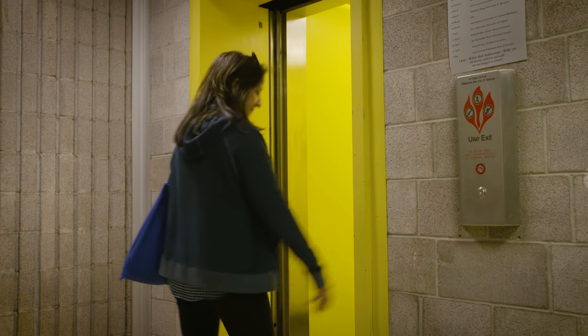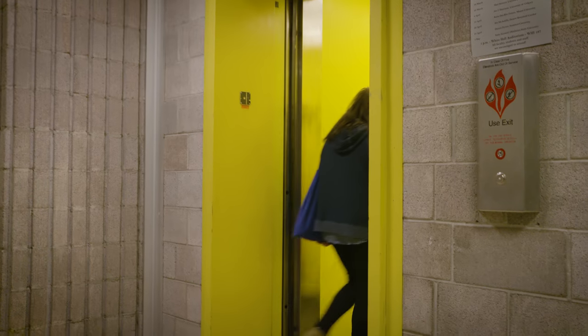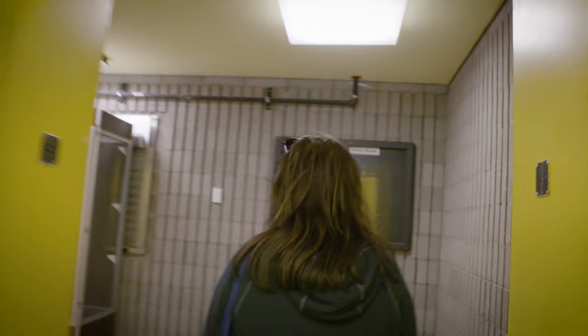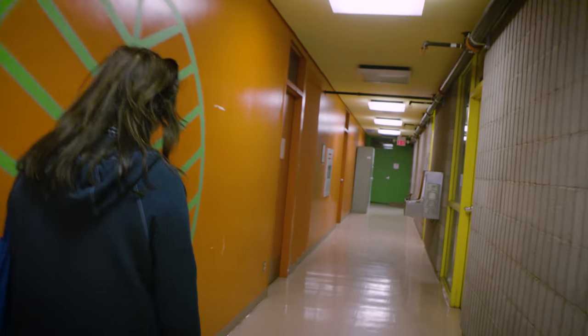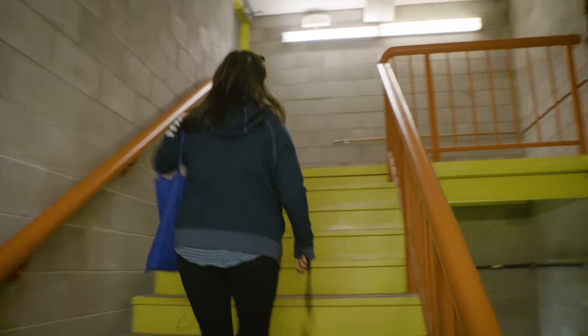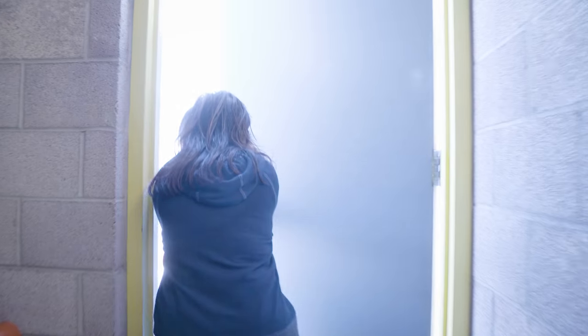We collect samples every day, 365 days a year. During weekends we put up a seven-day sampler. During weekdays we collect daily. Here at UNLV and around the city we collect weekly, so we have samples for every single day of the year.